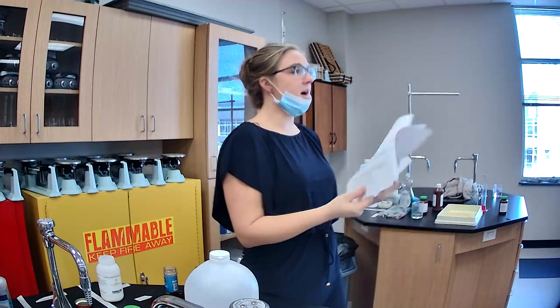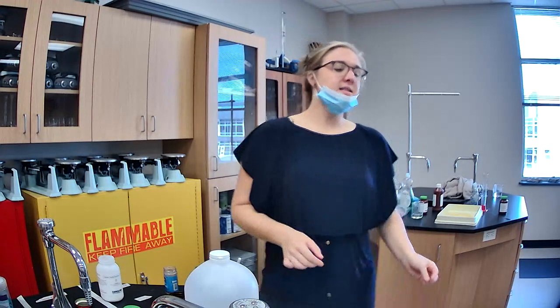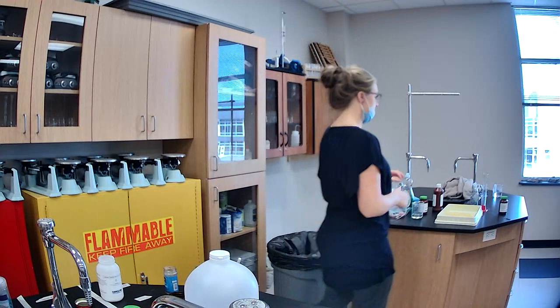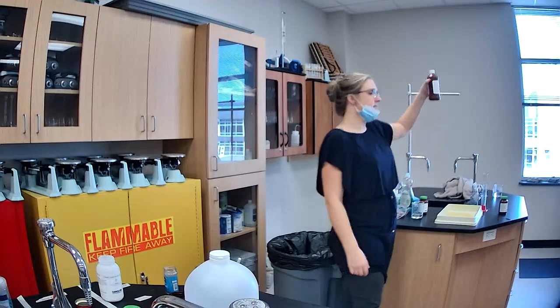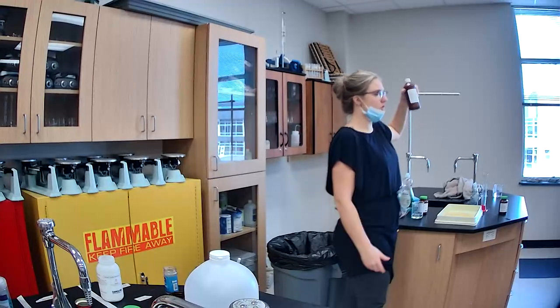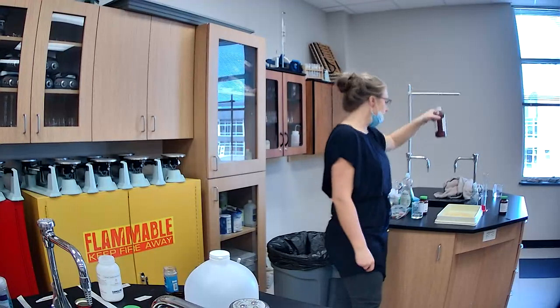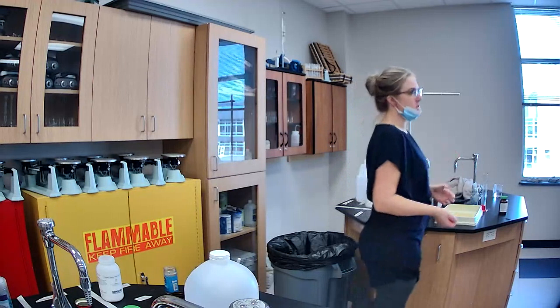Now, the next one, I'm also going to use hydrogen peroxide, but this hydrogen peroxide is 30%. So this one is 10 times stronger than what you would buy in the store. You can't buy this in the store. You have to order it online from California Science Institution. Typically, you only order it if you're in a lab or something like that.